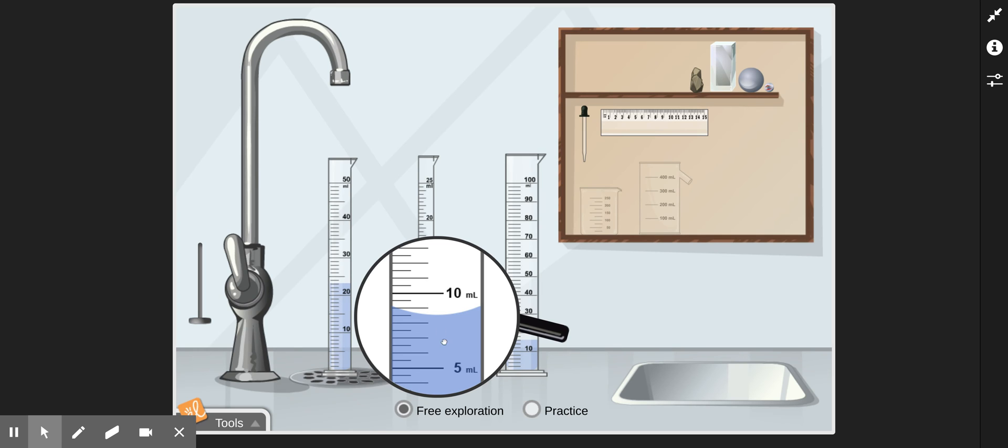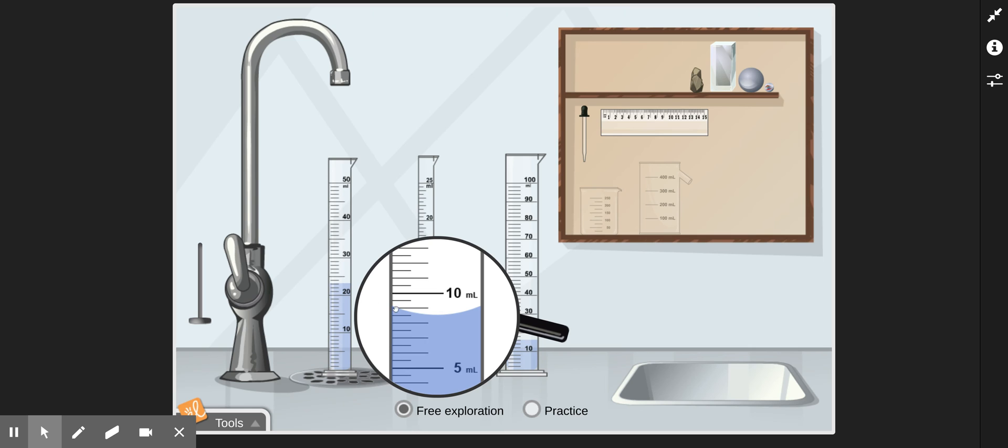So again, you take the amount of change, which is 5 milliliters, divided by the number of spaces, which is 10. And this leads to another common mistake. Students always want to take the larger number and divide by the smaller number. But that is not what is happening here. We are taking 5 milliliters of change, divided by 10 spaces. And 5 divided by 10 is 1 half, or 0.5. So each line here represents 1 half of a milliliter, or 0.5 milliliters.